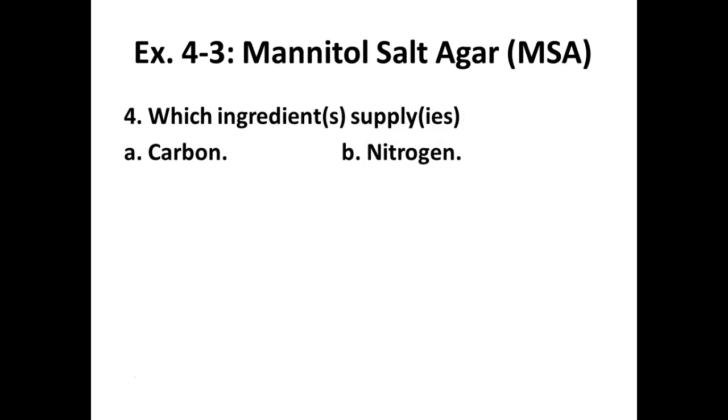We talked about this before when we talked about carbon and nitrogen sources for which one? Citrate or phenol red? Which one was really evil? The citrate, right? There was only one carbon source, and what was that? It was a citrate derivative, sodium citrate. Okay, and there was only one nitrogen source in that media.